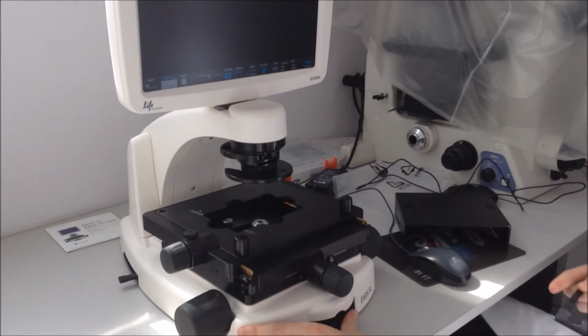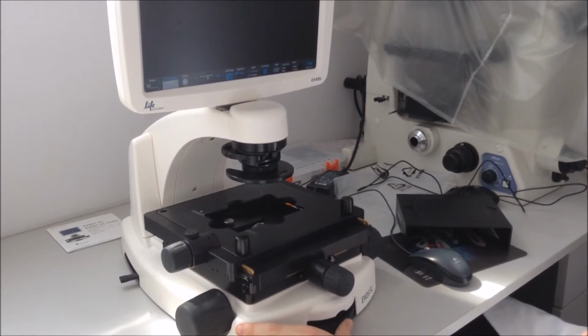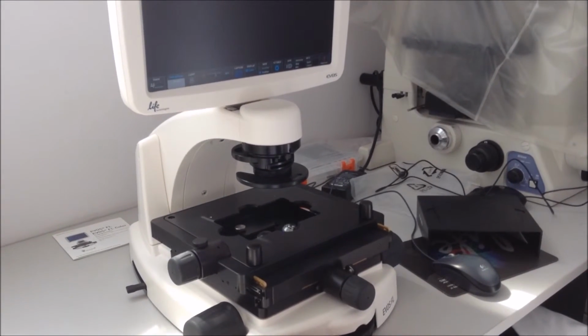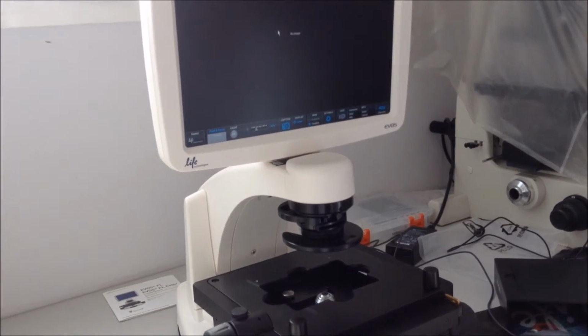On screen up here, you can see the lens objectives, and here it tells you what lens you're using. The lenses go from 4, 10, 20, 40 and 60, with 40 being the one that is most commonly used.